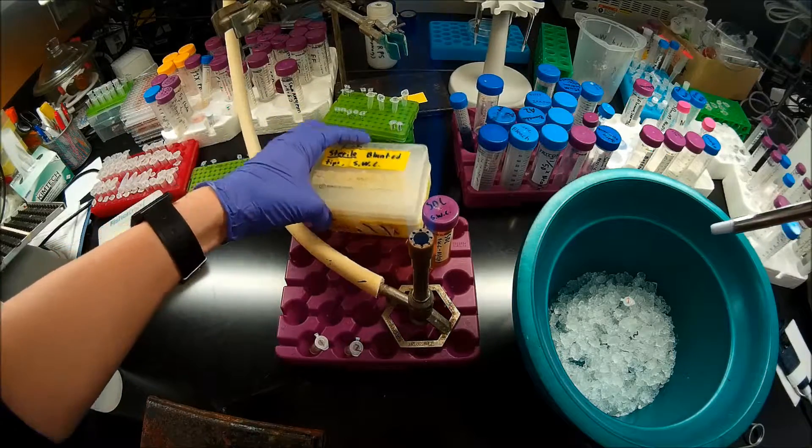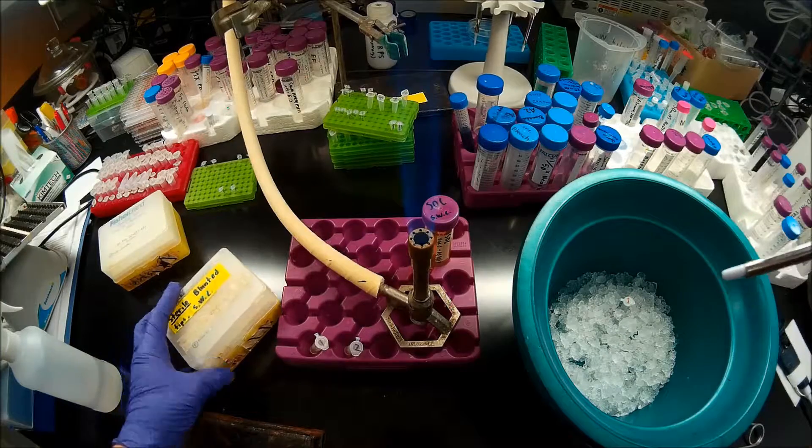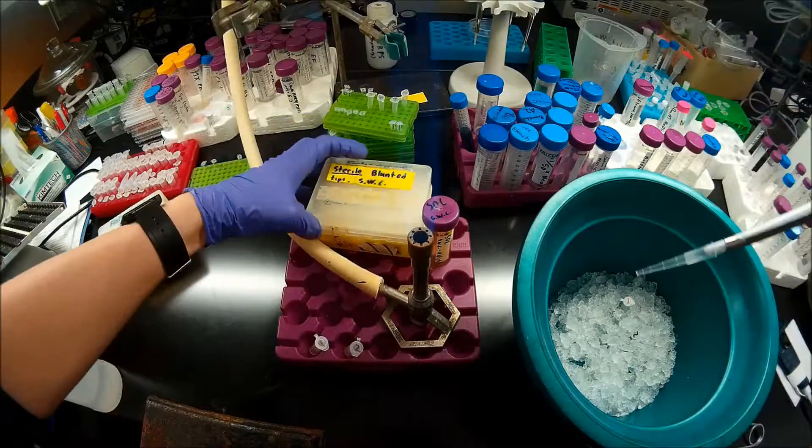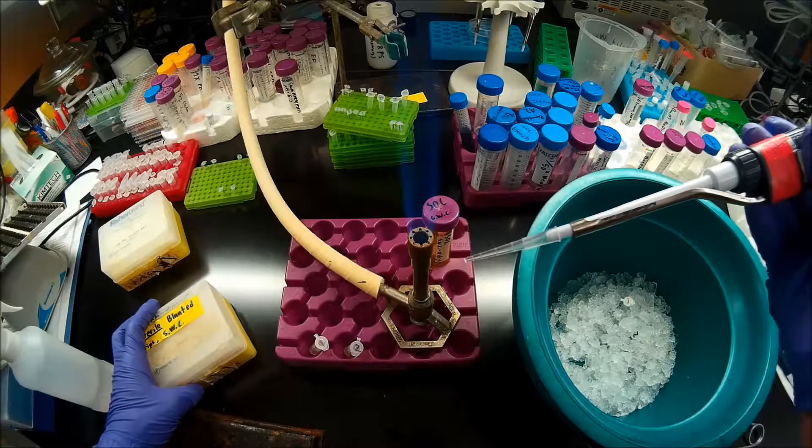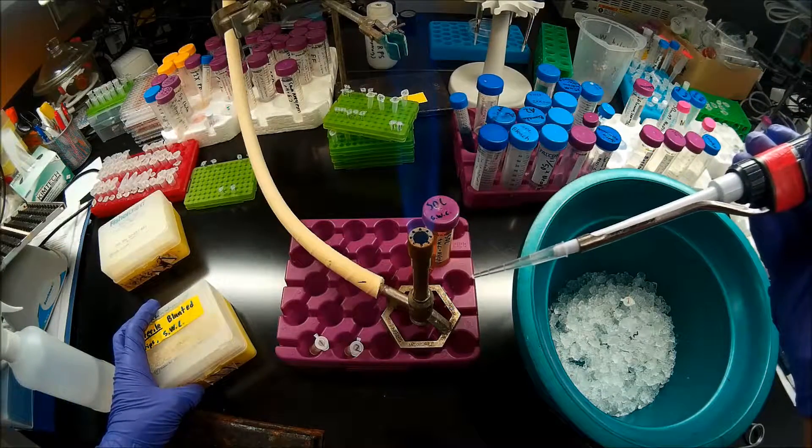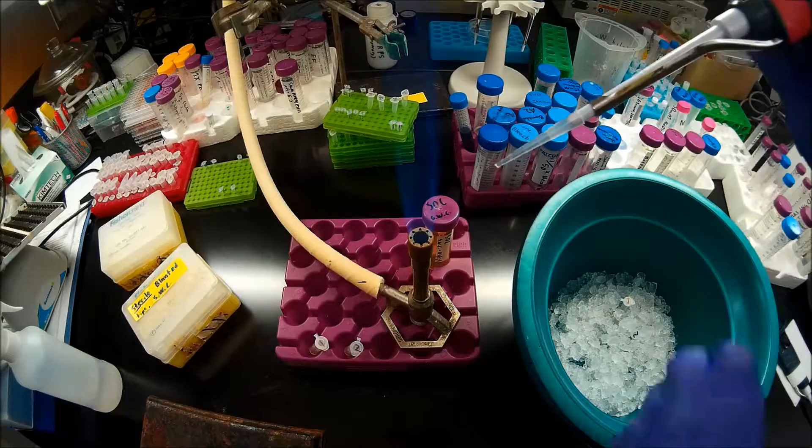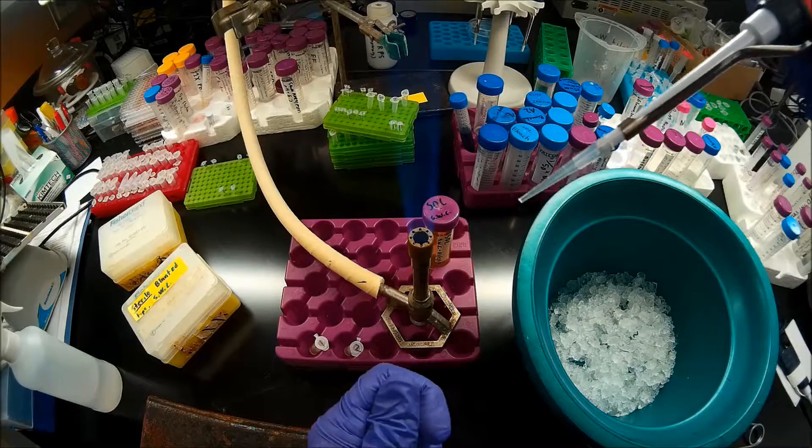So the reason I'm using these blunted pipette tips, as you can see, I've cut off the tip of the pipette tip before I autoclave them. The reason I'm doing that is competent cells are very delicate.